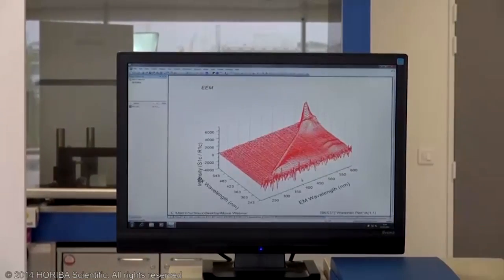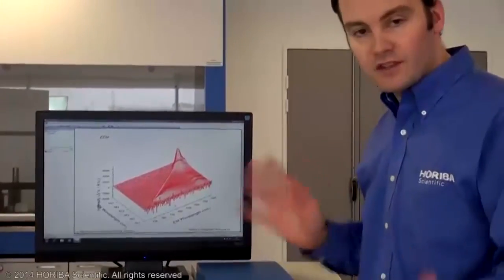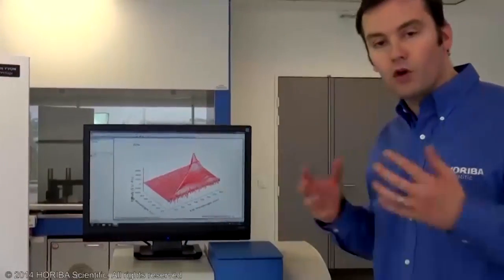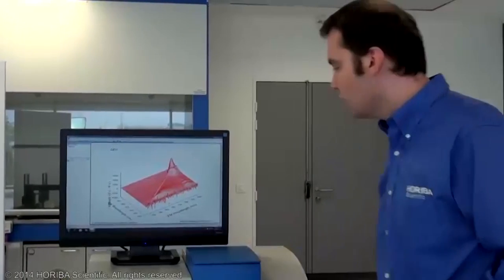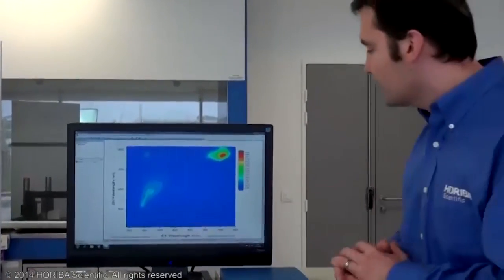So of course it takes some time to calculate, because again we get one spectrum, a full spectrum, so at least 1,000 points of information in one shot for each excitation. So you can imagine that the number of data is relatively high. That's why the computer sometimes needs time to display the results. So here we are. I'm just going into detail to explain this to you.